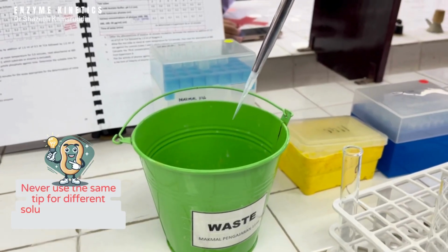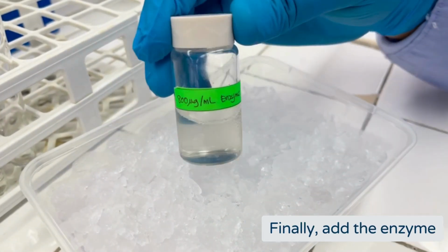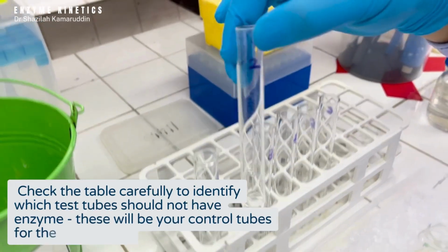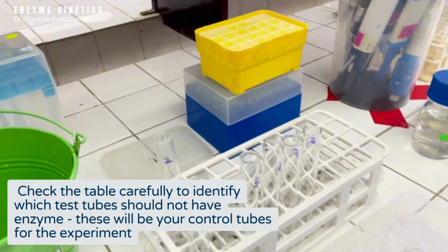Again, discard the used tips in the waste bin. Finally, add the enzyme. Important: check the table carefully to identify which test tubes should not have enzyme. These will be your control tubes for the experiment.